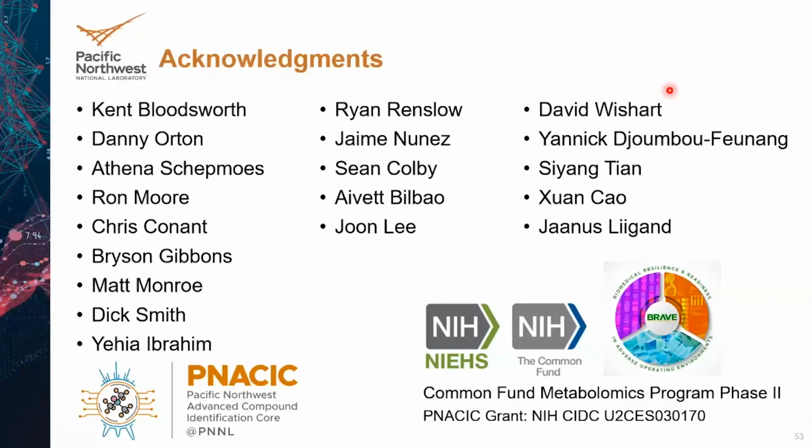So, for example, if I had a CCS error of 5%, and I was only using CCS, then I'm not happy with that 5% error. I would want it below 1%. But if I have CCS and say my error is 2 to 3%, which most of the predictive methods seem to settle in on versus experimental data, and I've got MSMS with a certain accuracy, and retention time prediction with a certain accuracy, and whatever property is being measured, if the errors are a little bit higher in each one of those individually than what I would like, what I would hope is that the aggregate of all of those properties would be relatively strong in terms of being able to say that that feature in the data is this molecule, and to do so with confidence.